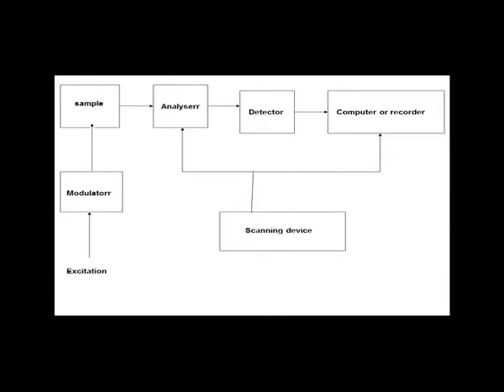Coming to emission instruments, schematically a typical spectrometer, the excitation can be thermal or electrical, but usually takes the form of electromagnetic radiation. In the latter case, it is essential that the detector does not collect the radiation directly from the exciting beam, and the two are placed at right angles as shown in the figure. A modulator fixed between the source and the sample, together with a tuned detector amplifier, ensures that the only emission recorded from the sample arises directly from excitation, neglecting other emission.